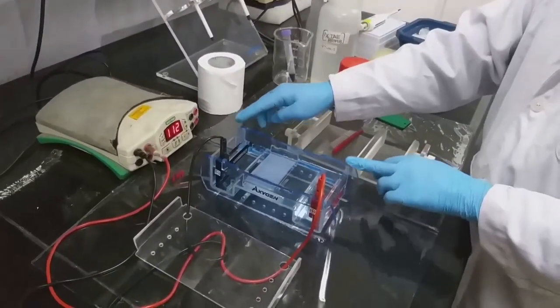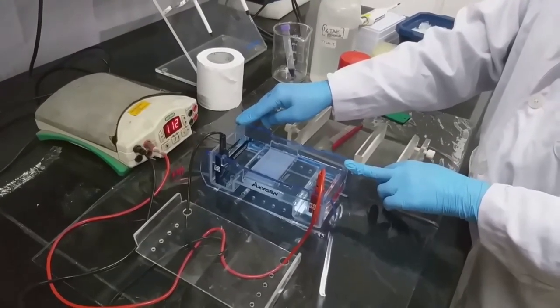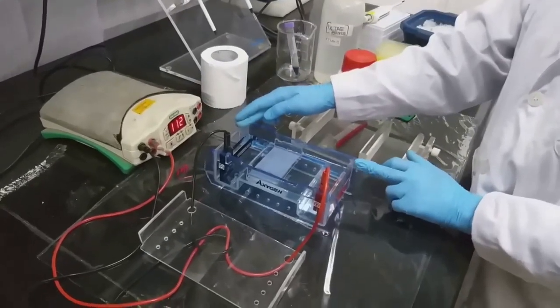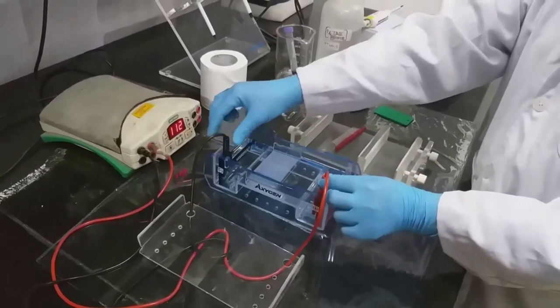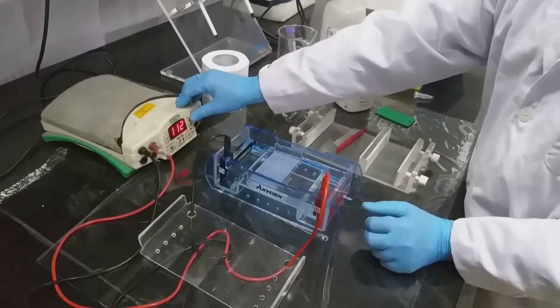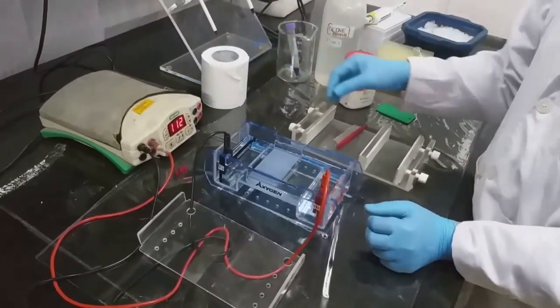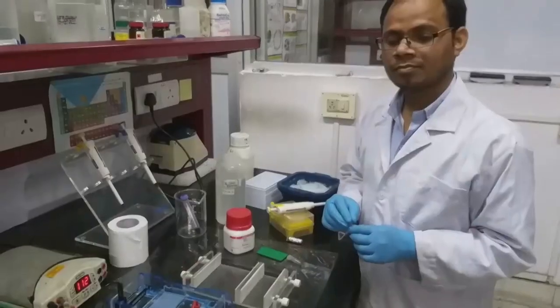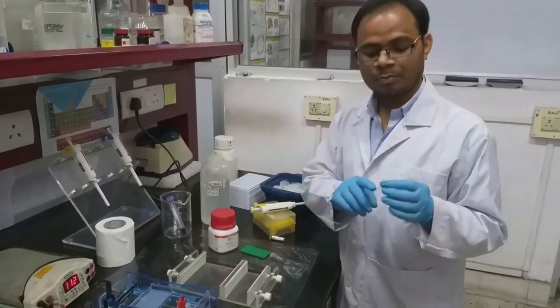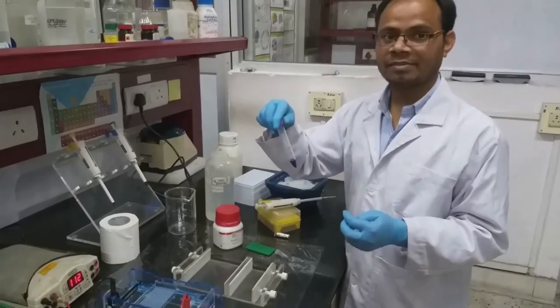Generally, for analyzing the DNA samples, we use agarose gel electrophoresis. This is the power pack and this is the electrophoretic apparatus. This is the negative electrode and this is the positive electrode. We can change the voltage from here. For loading the sample, we have to mix the PCR reaction mixture with 5x loading dye.